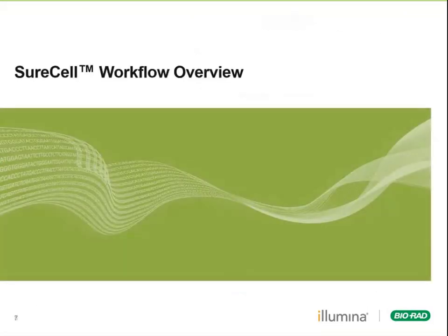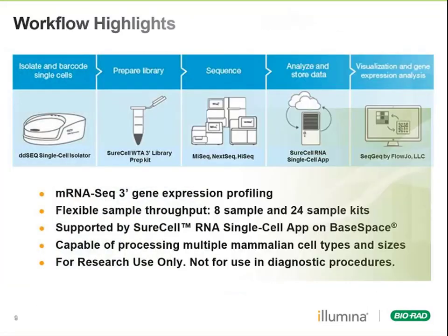Let's take a deeper dive into this workflow. To start with, we're going to use the ddSEQ SCI instrument to isolate and barcode single cells and generate cDNA. Then we go into the SureCell library preparation using a Nextera-based method. These libraries will be sequenced on an Illumina platform, and then we have a couple of different analysis options available to you. This is an mRNA-Seq expression profiling workflow.